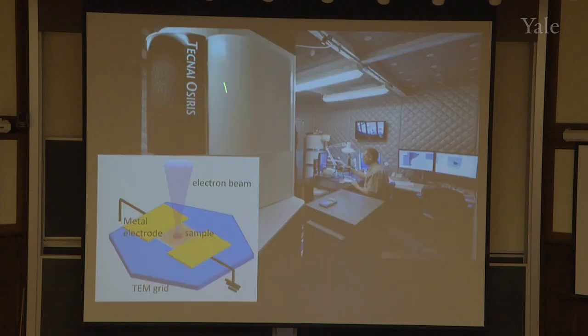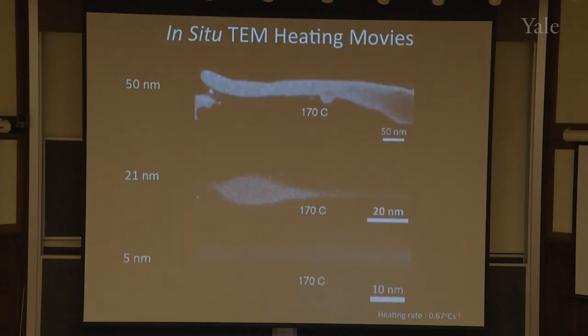So here, I stick these amorphous metals into the TEM again. Now they're amorphous, so their atoms are arranged randomly. But actually, atoms like to be ordered. They don't like this random thing. So if you heat them and give enough energy, the atoms will jiggle around, and they're going to order themselves. That's what we're going to do here.